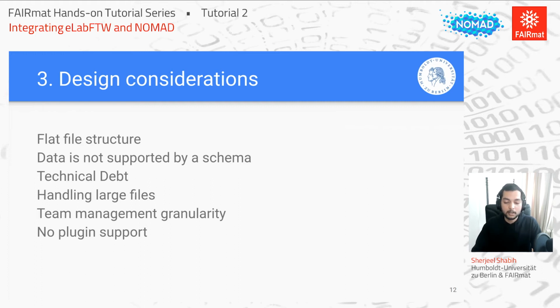Another problem, well, it's not really related to any system in particular, but once I'm developing all these features, we have to push them back into the main project, and then someone has to maintain them. And it requires a lot of effort into making sure that the design philosophy fits with everything. And also that it's useful for enough people that the original maintainers of the project would like to continue on top of that. So this is something I always had to consider.